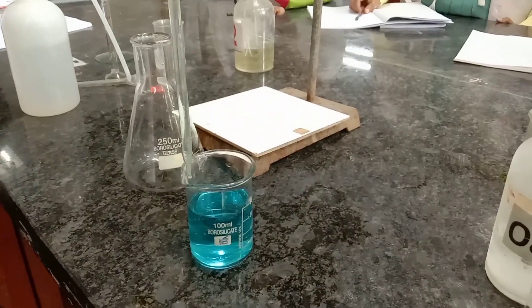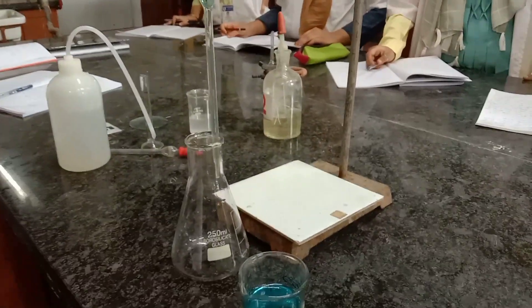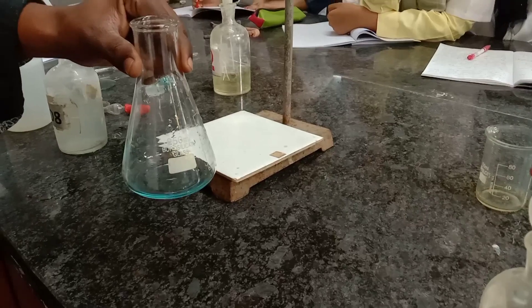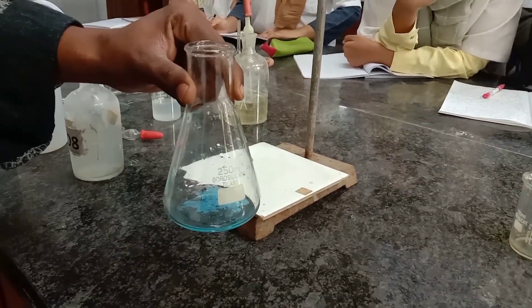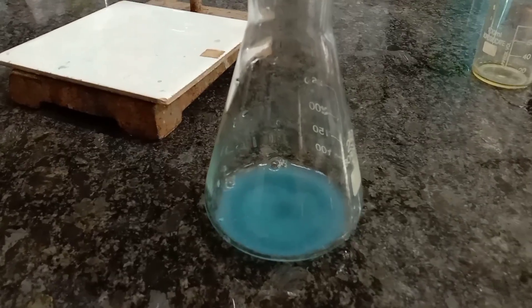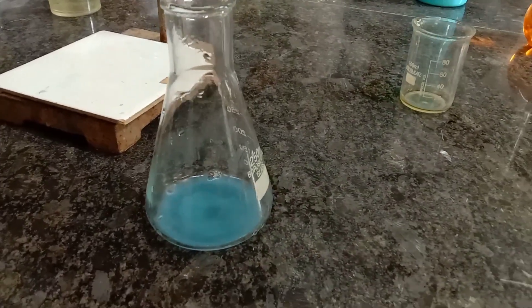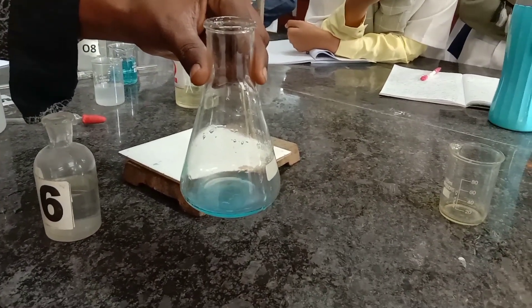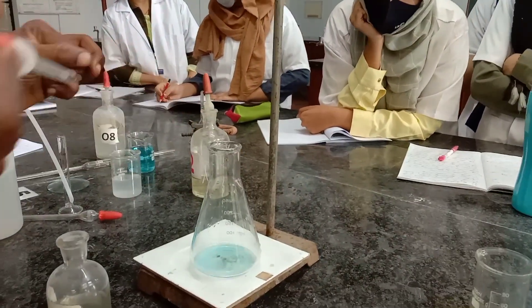Moving to Step 3 — estimation of copper ions in the given unknown solution. Take 10 ml using a pipette and drop the solution into the conical flask. Slowly add ammonium hydroxide dropwise using a dropper until we get a blue colored precipitate. You can see a blue colored precipitate in the conical flask. Now add a few drops of acetic acid slowly to dissolve the blue precipitate.